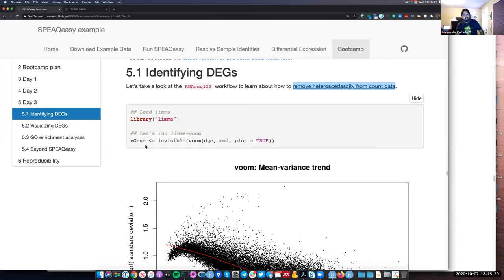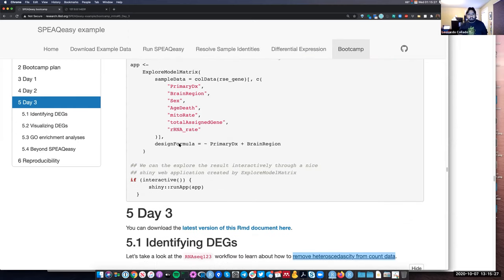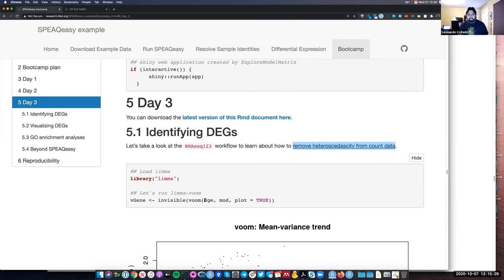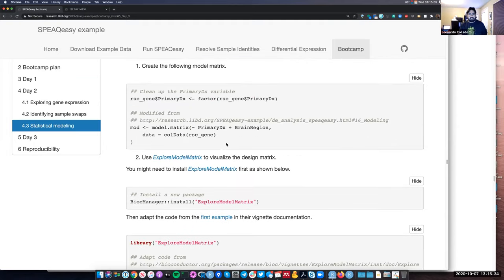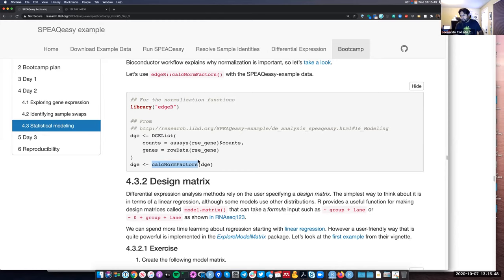Now that we know we need to run VOOM, let's actually run it. Yesterday we created the DGE object, which is a DGEList object from the edgeR package — we made it to use the calcNormFactors function for normalizing the RNA-seq data. The other object we made yesterday was the mod object, which is the output from the model.matrix function that defines our design model.